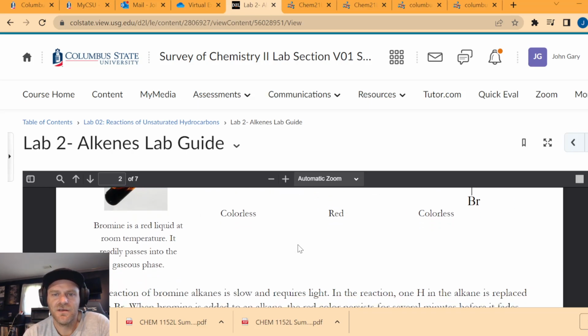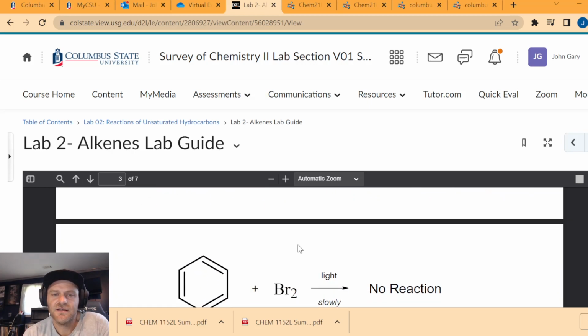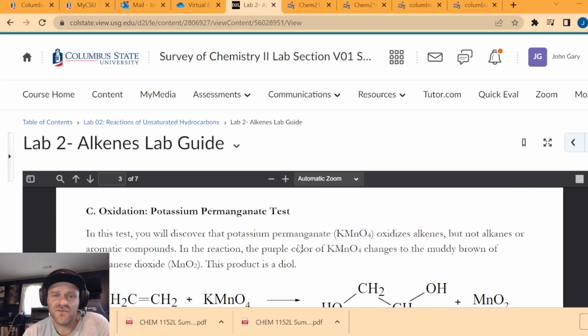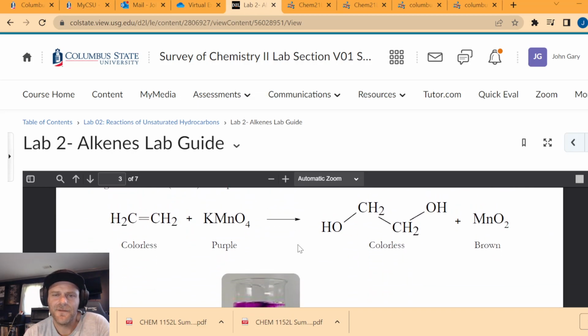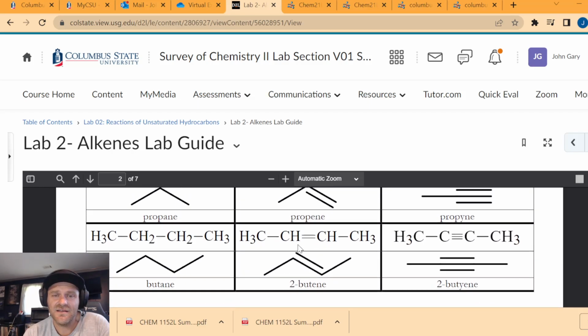Okay, so double check yourself, read the little script below the images, and make sure it matches what you're supposed to be looking at, because it's very easy to get slight variations in different compounds and molecules. Okay, so with that being said, let's jump right in.